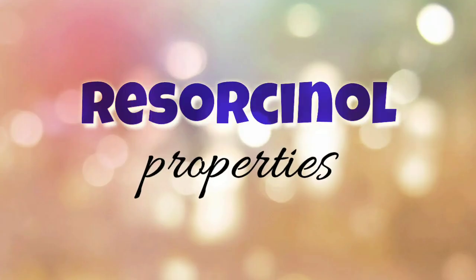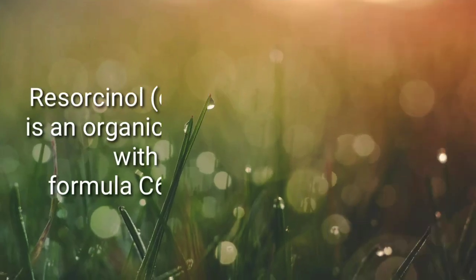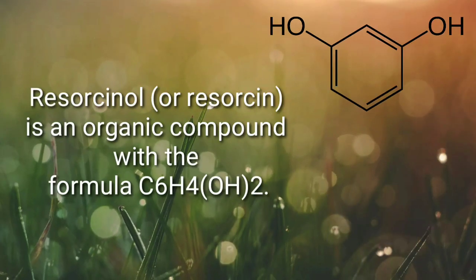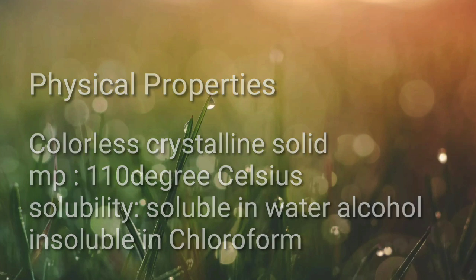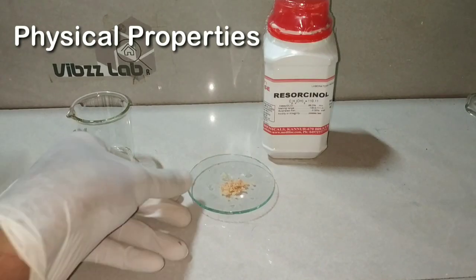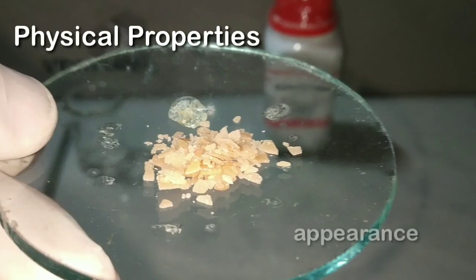Friends, today we would be learning the properties of resorcinol. Resorcinol is a colorless crystalline solid which is soluble in water and alcohol, and its melting point is around 110 degrees Celsius. I will be demonstrating the physical properties.